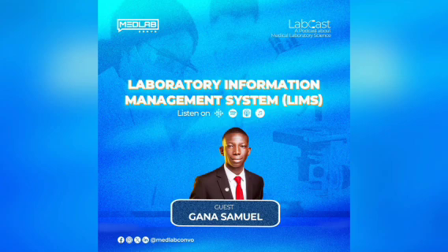And this involved the two-way communication between machines and the system, which helps us optimize our results, which helps us reduce many errors that are associated with the lab. So, laboratory information management system is a system that helps us to optimize everything that has to do with a patient sample. Thank you.